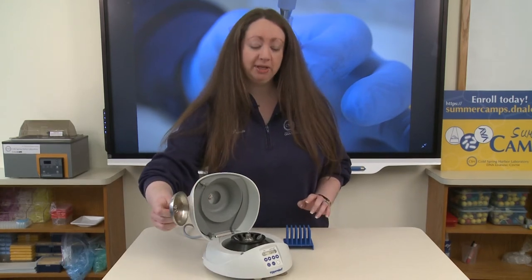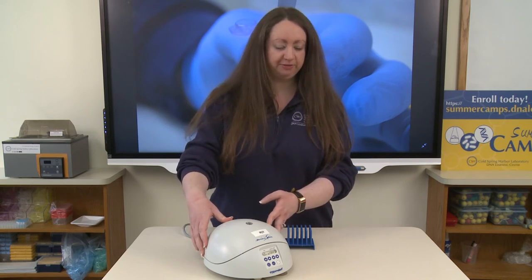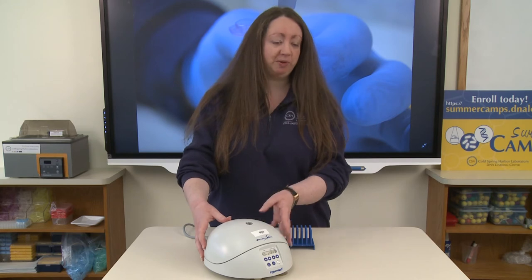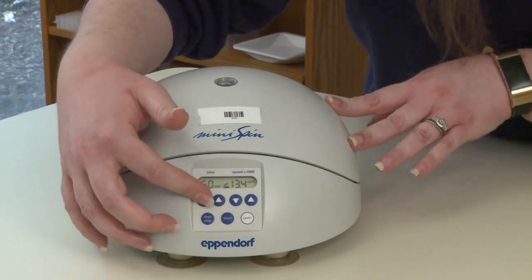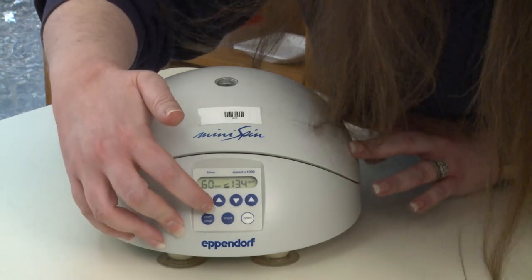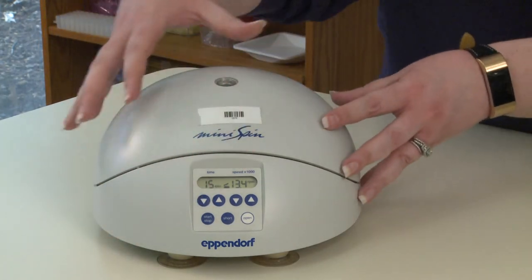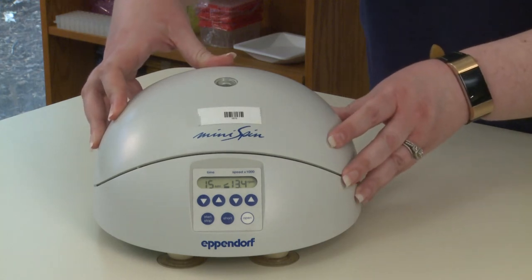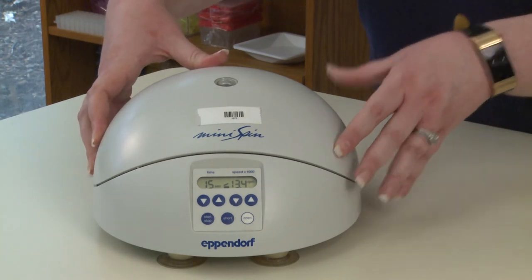Make sure you place that small inner lid back on the rotor — you will hear it snap into place — and then close the large outer lid. If you do not have a balanced rotor and you do not have that small inner lid in place, your centrifuge will make a loud noise indicating something is wrong and you can turn it off. Now we have to set the centrifuge. Right underneath the screen where it says time, there are up and down arrows to set the time. I'm going to spin these for 15 seconds. On the left-hand side is the speed; we already have these set at 13,400 RPMs, but make sure you look at your protocol and set this to whatever speed your protocol calls for.